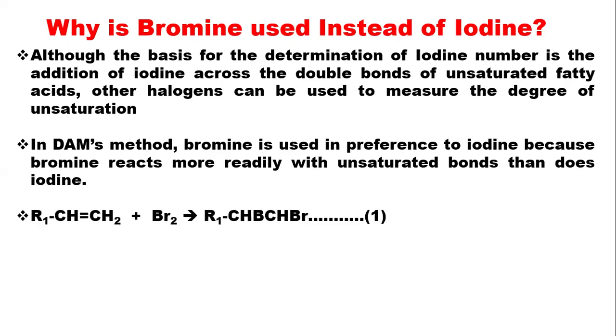So if we look at the reaction, the reagent is allowed to react with a known amount of fat in chloroform. A solution of fat is made in chloroform.